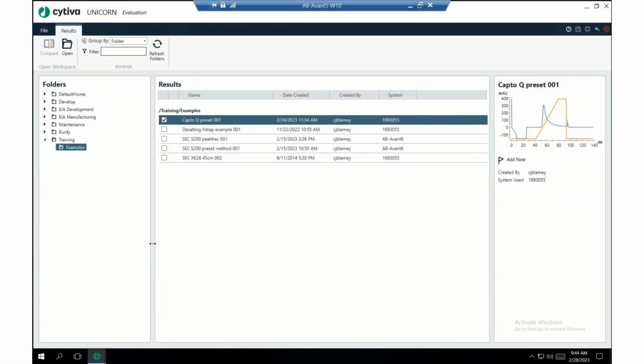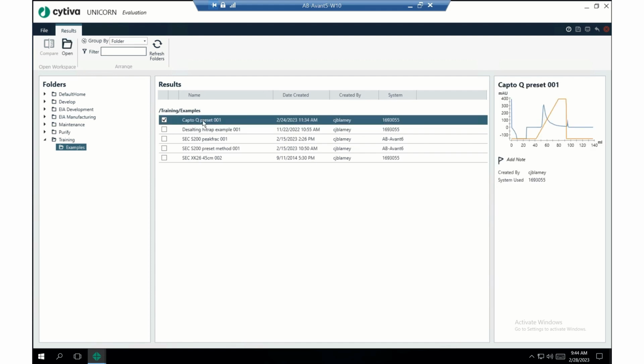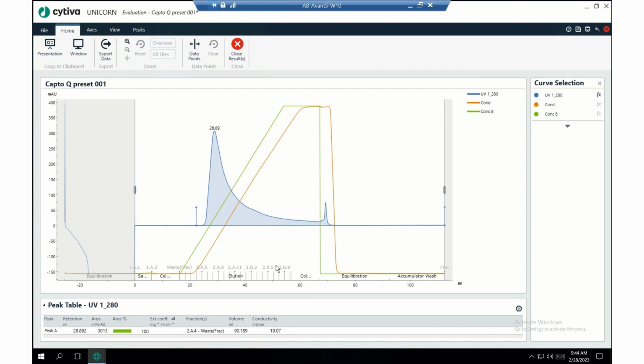Okay, so here we are in the evaluation module. In order to open it, we're just going to go open the training folder, then hit examples, and then here's our result file, the Capto Q preset. Just open this. So here's the result, which I think looks pretty good. I'd like to show you a few things.